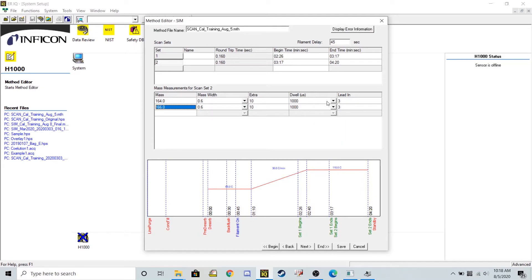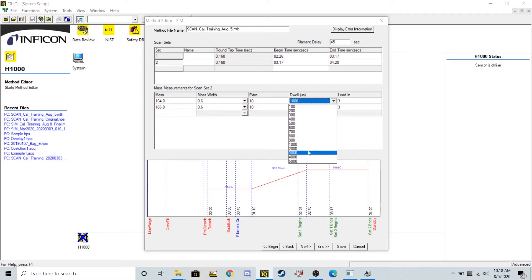Over here I'm also going to adjust this dwell time. So for these ions, the higher your masses get, the longer it takes for your mass spec to search for that ion. This dwell time is how long it's going to search for it, how long it's going to look for it.